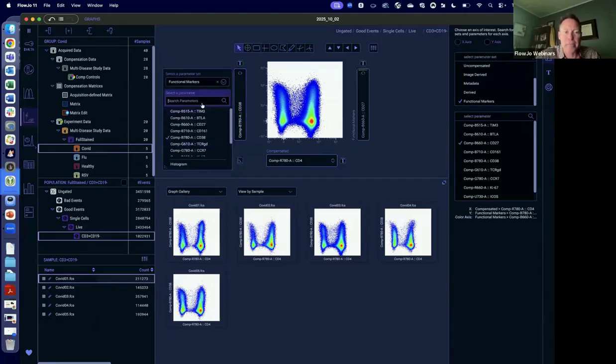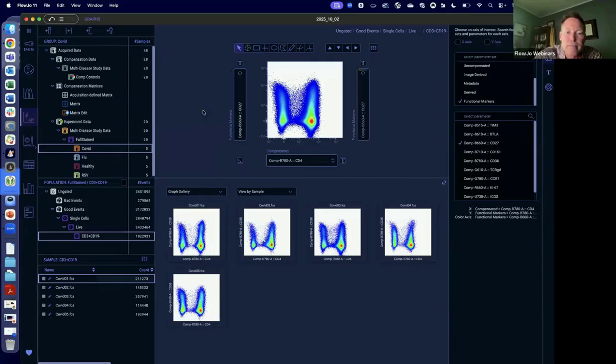Oh, I did 38. I think I meant to type just an 8 to start. Oh, maybe not present. All right, well, let's do 427 activated T cells.